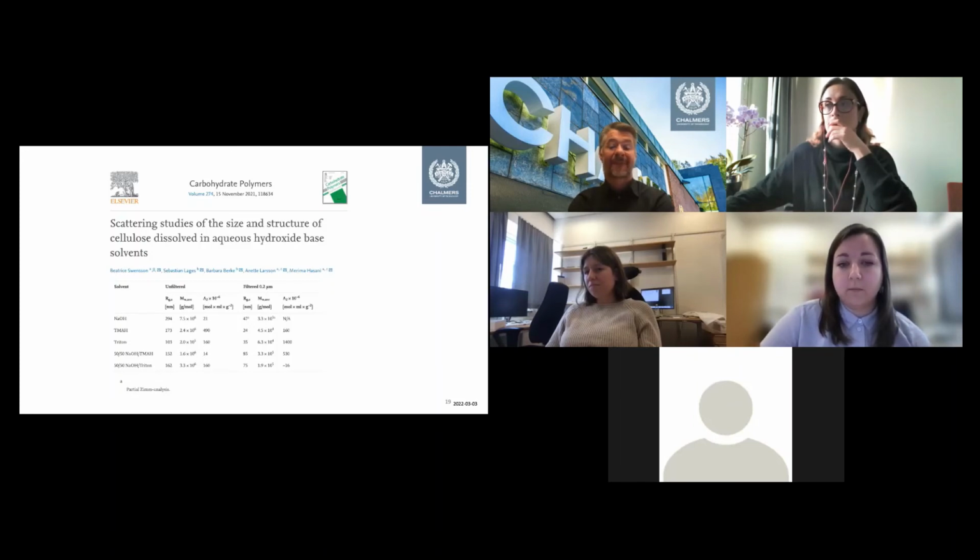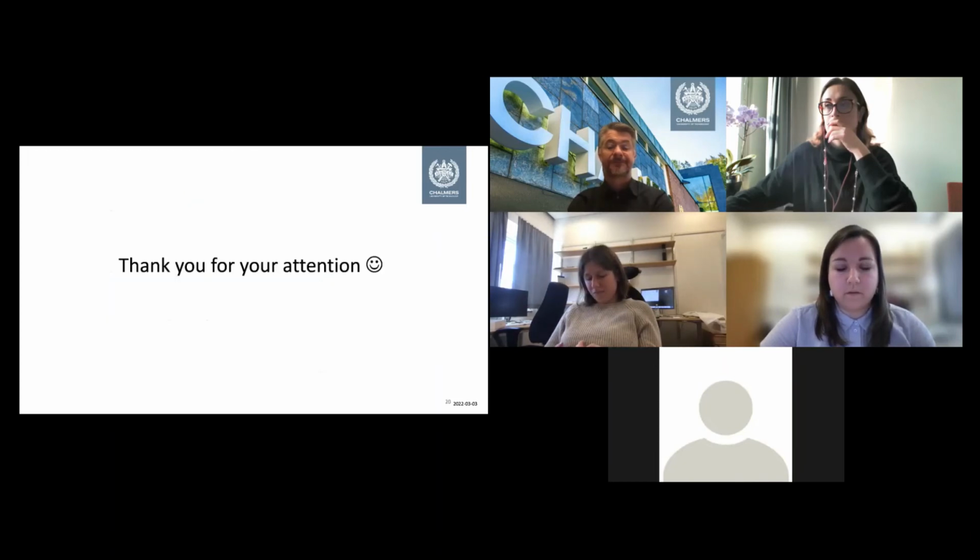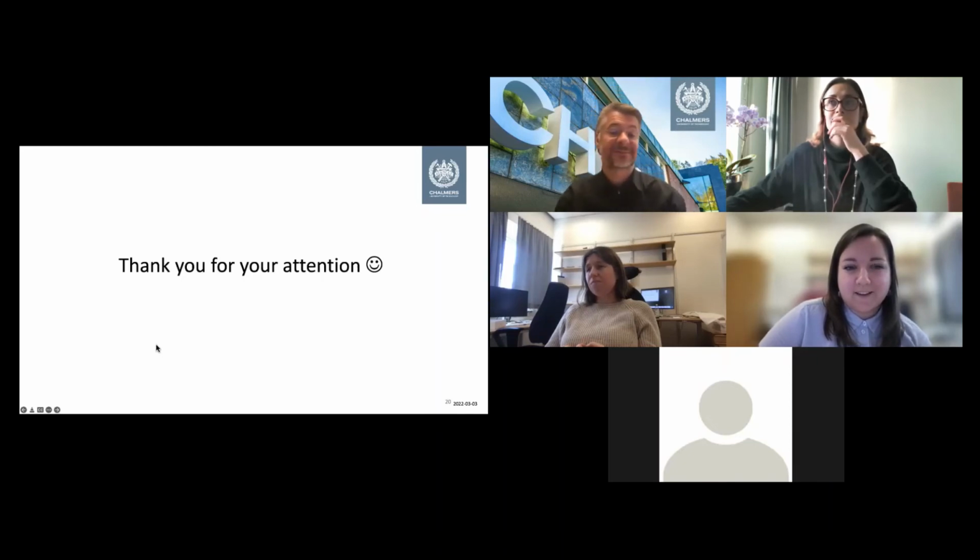So these are some of the many things that you can determine with light scattering, which is very useful and can be a very good technique to use together with, for example, small angle X-ray scattering, to give an indication forward, for example, of what kind of model you would need to use to fit your data. And that's it about light scattering.